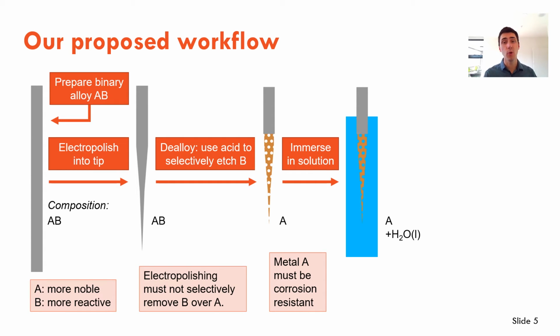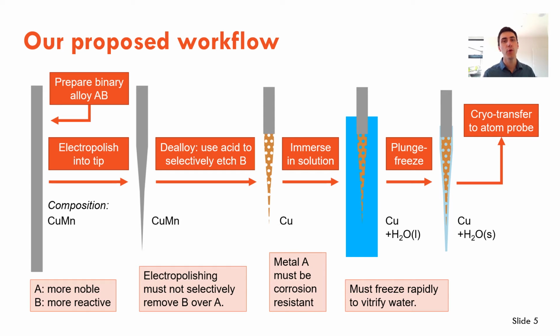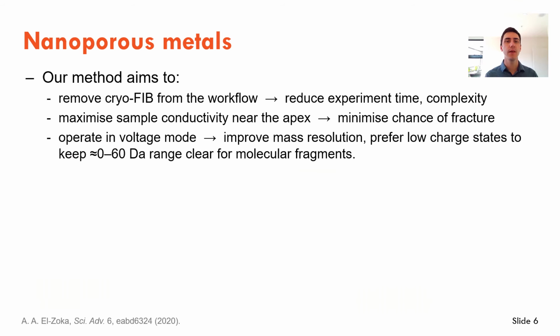We then dip the nanoporous tip into a liquid, such as water or aqueous solutions, and then plunge freeze in liquid nitrogen or ethane and cryo-transfer to the atom probe. Looking ahead, we're looking at using copper as the more noble metal, and I'll talk about why in a second.